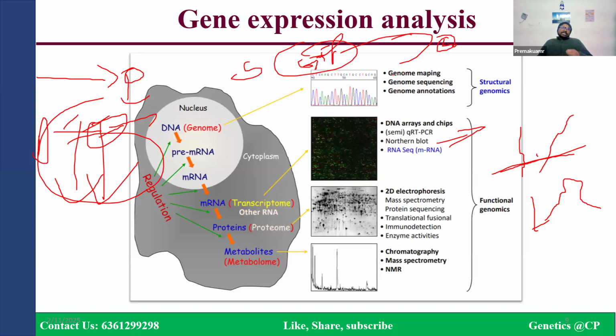When the gene is expressing in the cell, the fluorescence increases, and by using confocal microscopy we can study that expression. That is another thing: in-plant expression, where we get the expression in the plant itself. Here, while the reaction is running, we are able to quantify the expression. That's why it is called real-time PCR. Okay, you got the point?